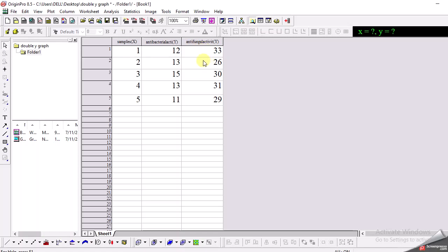So for this purpose I use an option which is called the double y graph. Simply after transferring your data to Origin, you need to make sure that you have set the columns as x and y-axis.